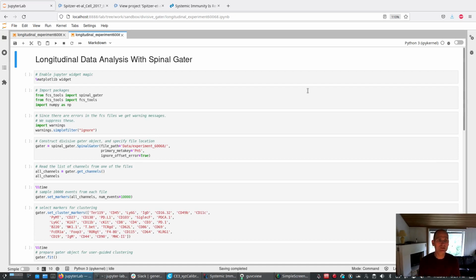Hello! In this video I will show you a little bit about what I've been working on lately. I have made a clustering algorithm that works in an interactive way, so we can first sort events in FCS files in such a way that similar events are next to each other. And when we've done that, from a visualization of that, from a heat map, we can cut up or split the events into clusters.